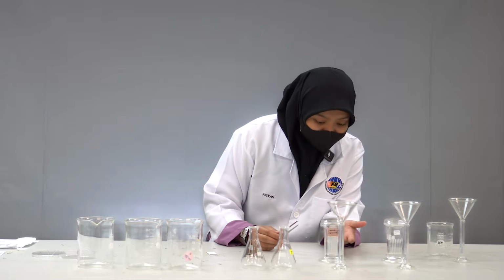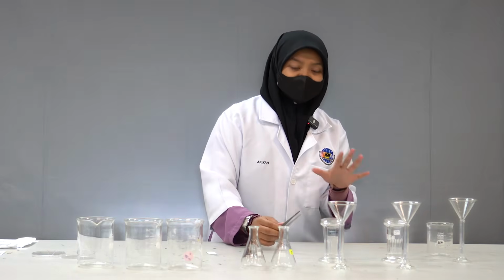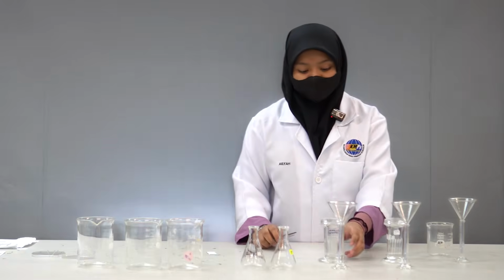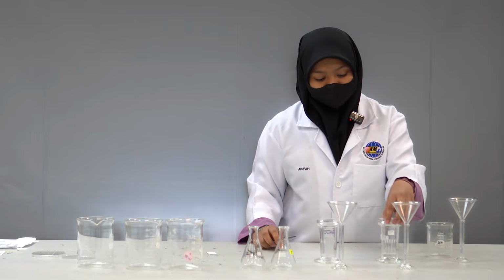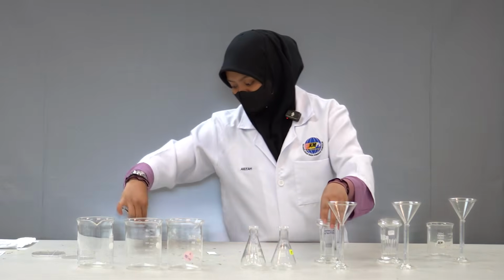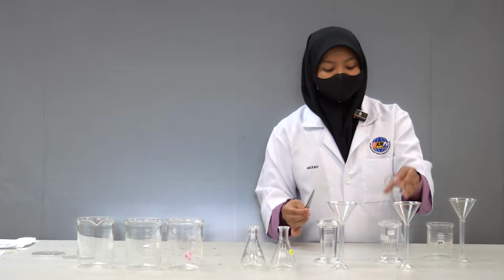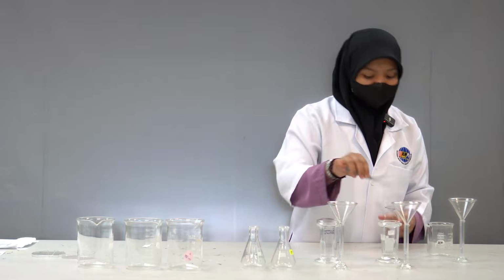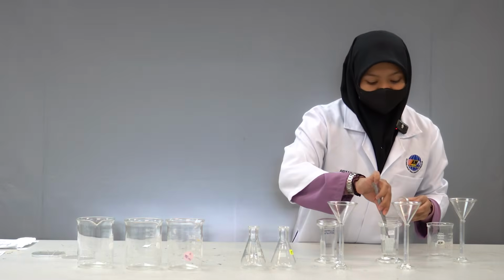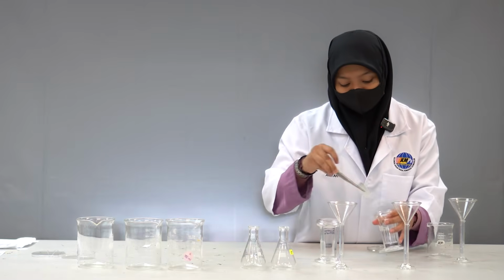Until you see the solution goes up to 1 cm from the top, until it reaches the line that we already measured earlier. Then you take it out. For the second thin layer, you put it in the chamber DCM and hexane. Same also, wait until it reaches the top line. Then you take it out.